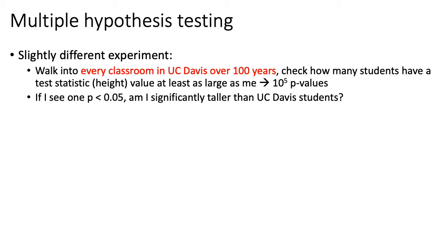And so again, the reason this is relevant to ChIP-seq peak calling and pretty much all other statistical tests you would do on genomics data is that on the previous slide, when I was showing you the output of the MACS2 peak caller, there are p-values associated with each peak, which tell you essentially the chance that you would see a peak in your ChIP-seq assay by chance.